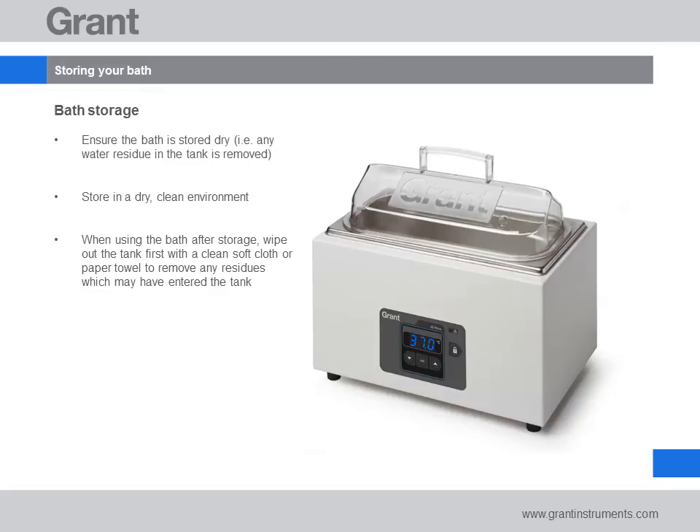When using the bath after storage and before filling with water, briefly wipe out the tank with a soft cloth or paper towel to remove any dirt or dust which may have accumulated.